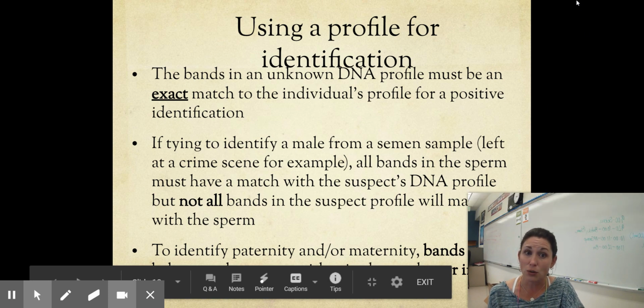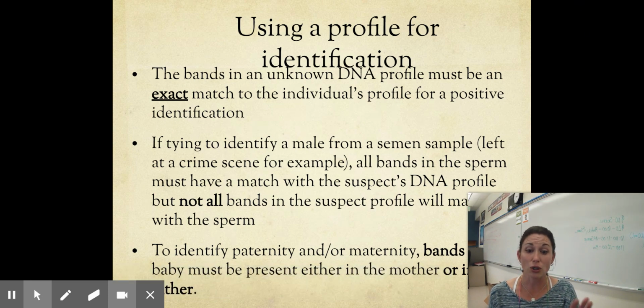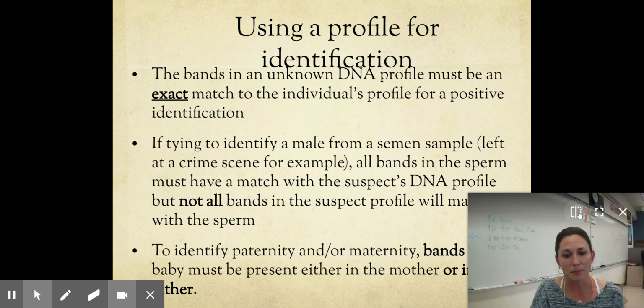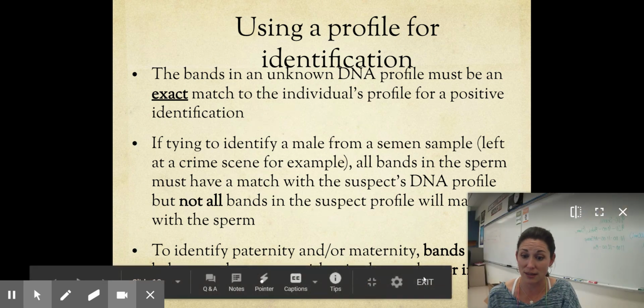However, if we're trying to identify paternity or maternity, the bands of the baby have to be present in either mom or dad at all times. And that's kind of interesting. We will do some practice with that eventually so that you can see that.